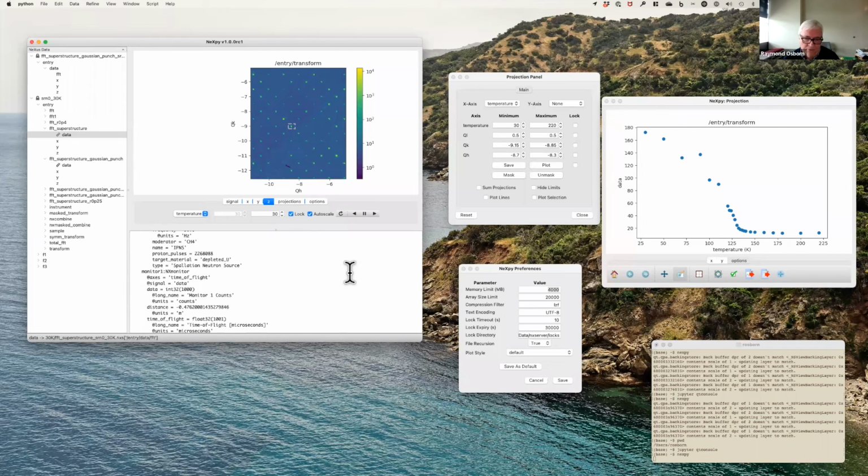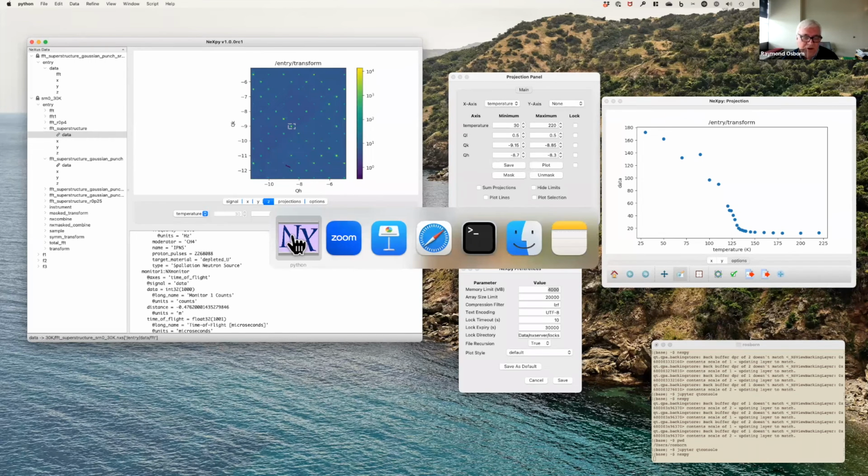But in those cases, it's obviously best to save it to a file. As I say, we've analyzed about 250 terabytes here, and this is just my laptop. This is quite an old one, it's not even an M1 MacBook. I think I have 16 gigabytes of memory or something, but it's not huge. But you can change the memory limits if you need to.